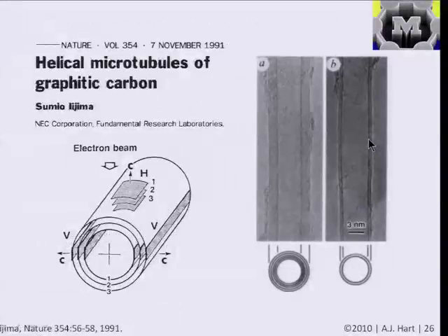So this, for example, TEM was what was used almost 20 years ago to first show the structure of single-walled and multi-walled nanotubes. And now you can imagine that the electron column that was horizontal in the previous image is coming down like this, and we're hitting our suspended carbon nanotube with a TEM, and we're taking pictures that give shadows that show the individual walls or the individual layers. So our single-walled tube here is casting an image like that, and at cross-section it looks like that.